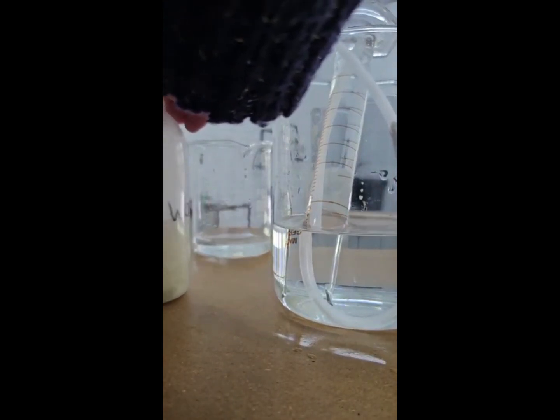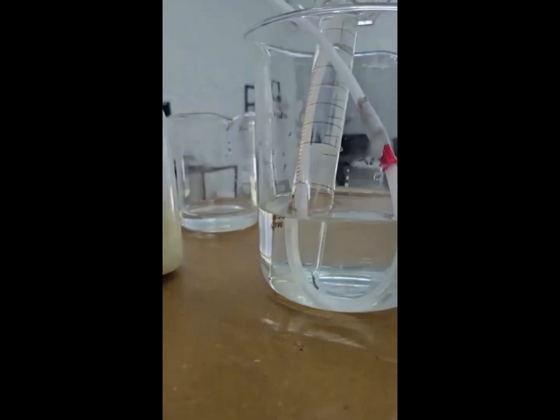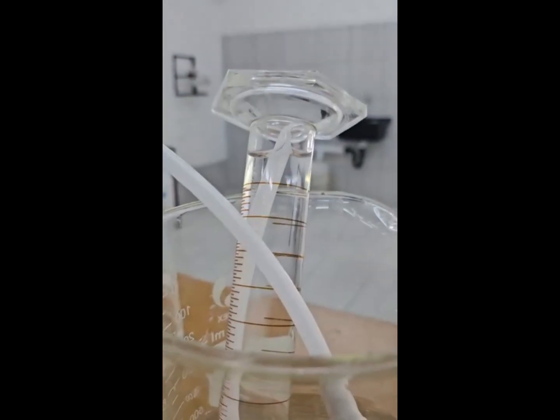So we can now look at our measuring cylinder and look at the gas being produced. We can see the liquid, or the water level, lowering in our inverted measuring cylinder.